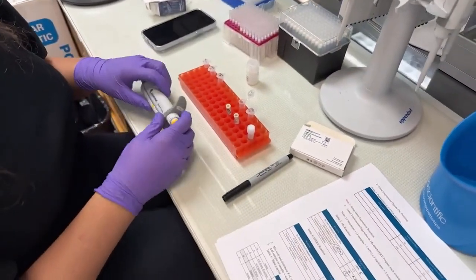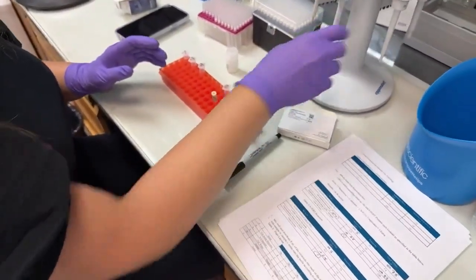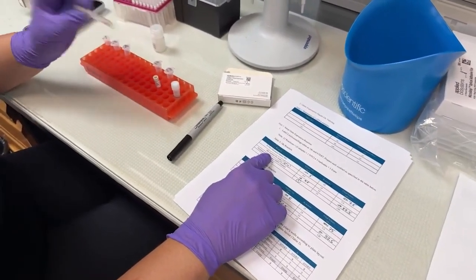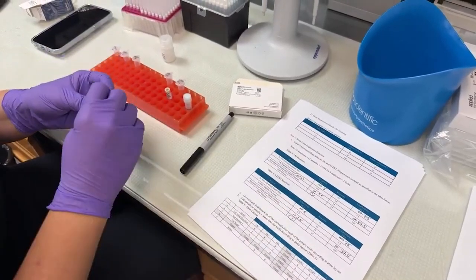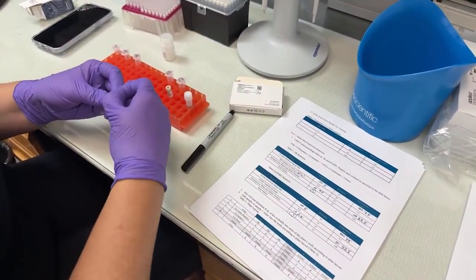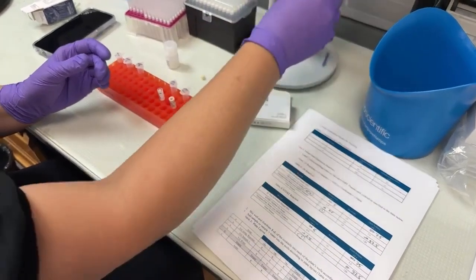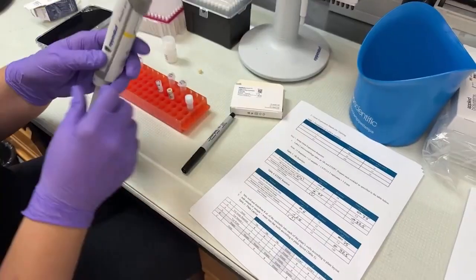All right, so that was our first component. We will move next to our assay mix, which includes primer and probe. That's everything that's in here. This is for our 18S reaction. Take off the lid, and I'm going to dial up 7.5 microliters.